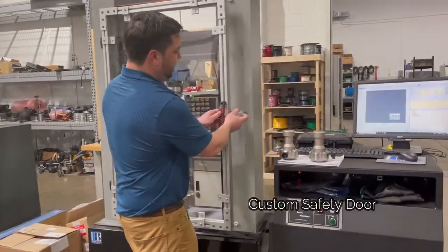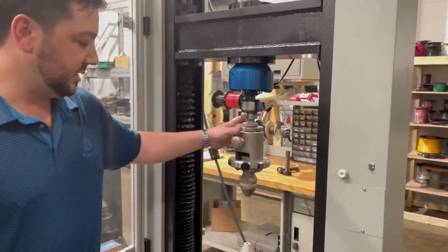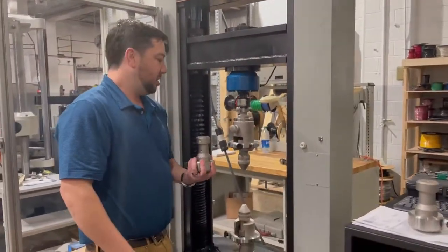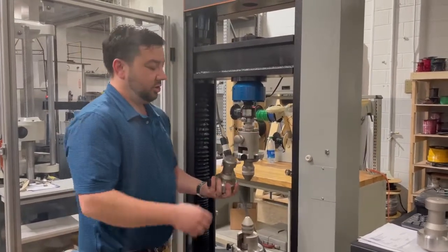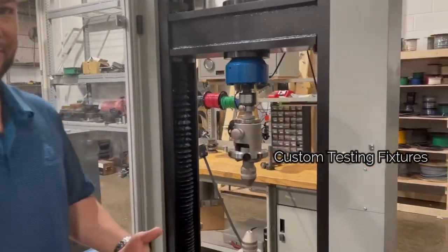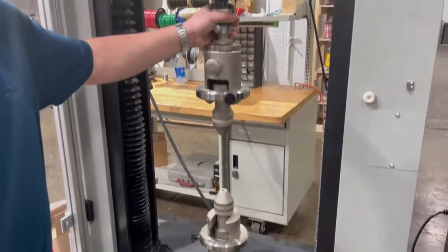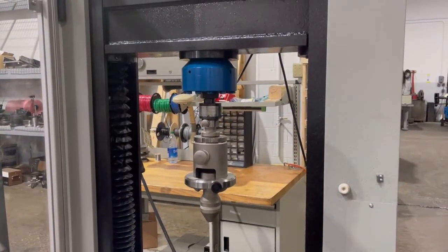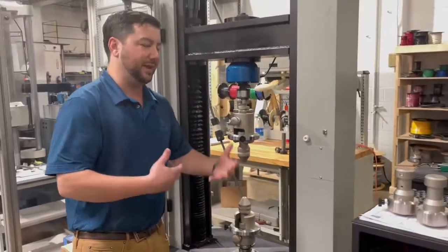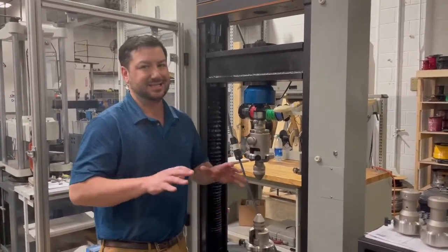What we've done with the tooling setup here is this customer in particular was doing threaded end specimens and button head specimens. Using the same holding setup, you can utilize button head holders and threaded end holders to do various different types of specimens. We also have a self-aligning fixture up on top to make sure everything's self-aligned for test. These are component-level fixtures so you can change them out based on what kind of specimens you're doing. If you're doing lots of different specimens, a modular setup like this is the best way forward.